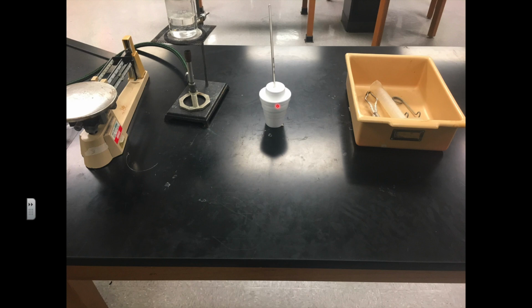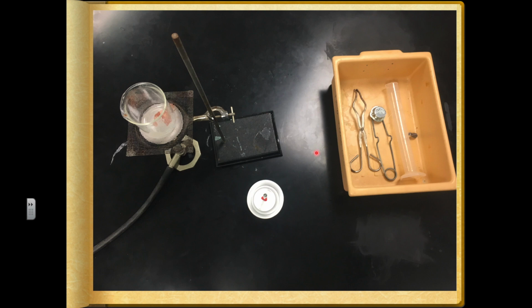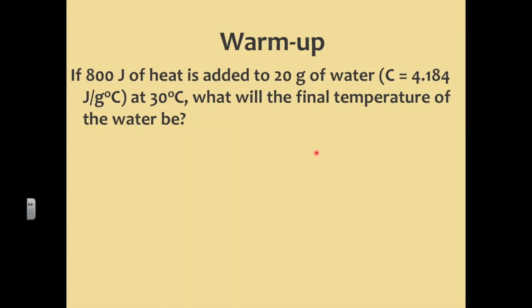Duh, right? Because hot metal got put into it. The temperature would rise, and we would record the final temperature. So we have an initial and a final temperature. That's all the extra equipment you really need. It's a very simple experiment, but it's very nice to see too.